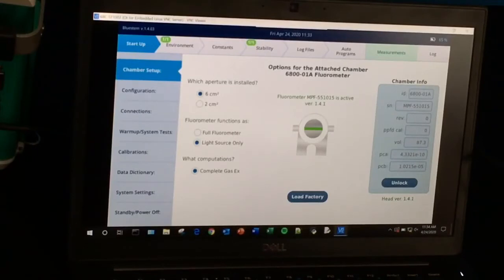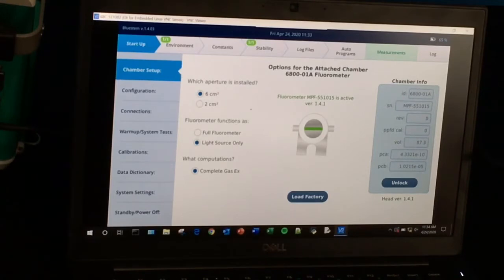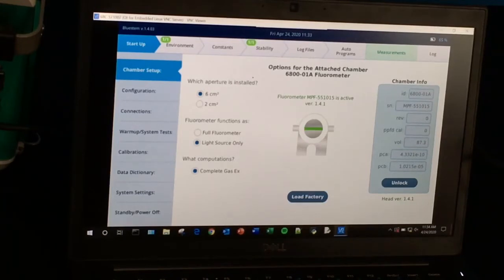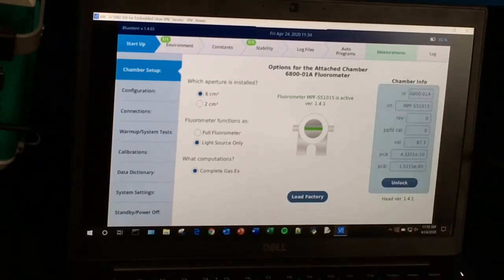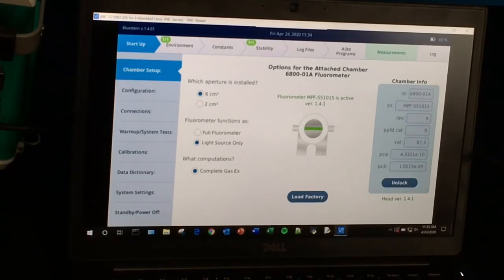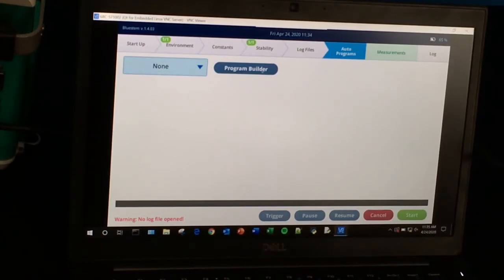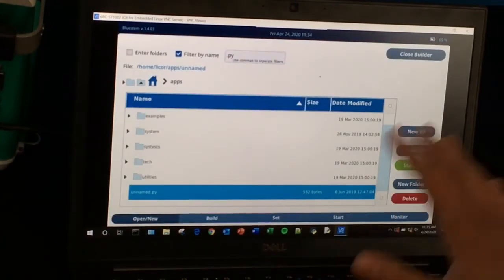I like to use the VNC viewer just because it's easy and allows you to use your keyboard more. Now I'm using my VNC viewer, and if you need help on how to set that up, there's a video on our support website on how to connect to your computer. Here we're going to go to Auto Programs, and this is where you can locate the Program Builder right here. We'll select that and it will take you to the builder.